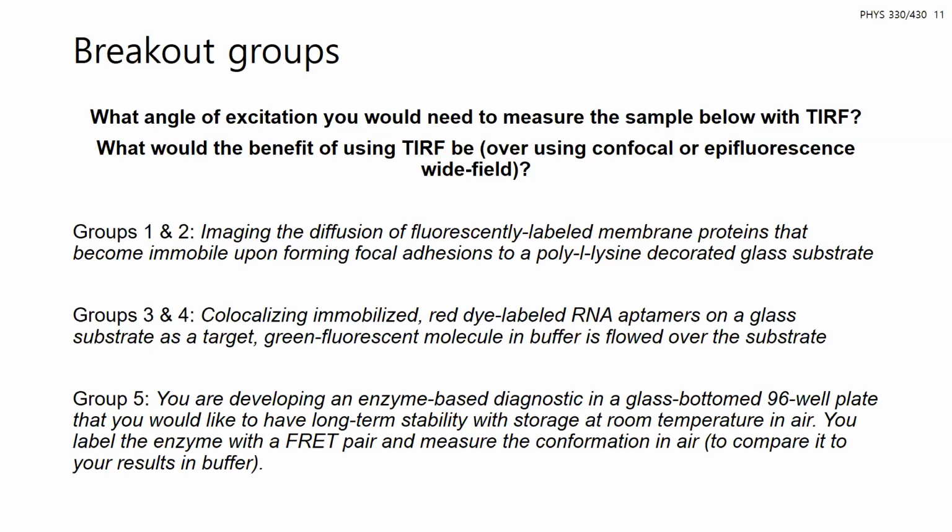So we found that this would be the best way, better than the other. And by that, you're also not getting the outside signal from whatever is happening beyond that surface. So you're getting rid of noise in a way and imaging exactly what you're interested in. Why not confocal?